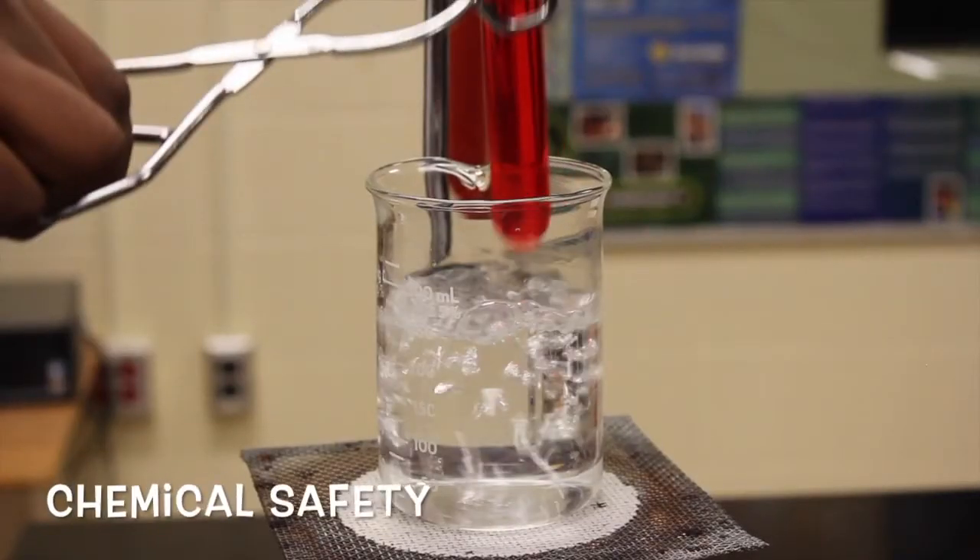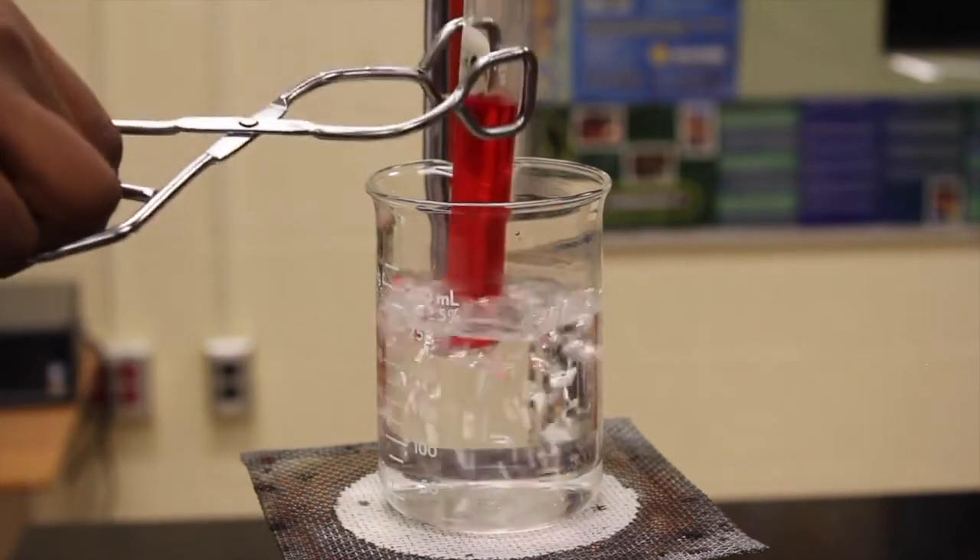Let's start off with chemical safety. To handle chemicals, there are safety rules that need to be followed. When working with any kind of chemical, the use of small containers is strongly recommended for easy control.